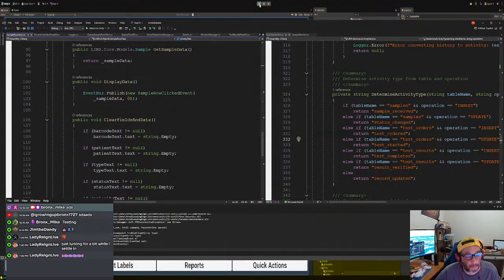All right, folks. Okay, I see what's going on. This is kind of ugly because you have to make sure on the queue, let's do the queue first, that the row is the right height. So we have the recent activities rows. It's 50. And then the type search has to be row height too. I think it's 50. Let's see how that looks now.